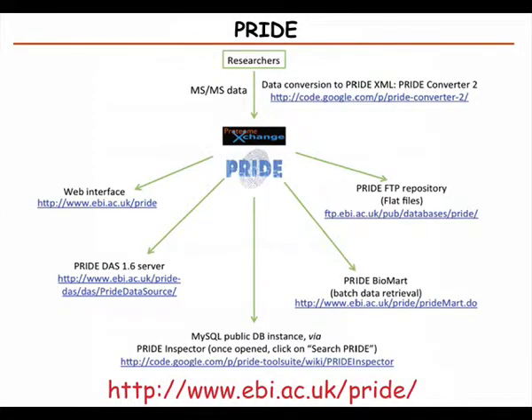So one of the biggest players here within Proteome Exchange is PRIDE, which also comes from EBI. They've set up so that when people want to publish, they deposit their data there, and they get an ID number that they can put in the publication, and then people can go back.